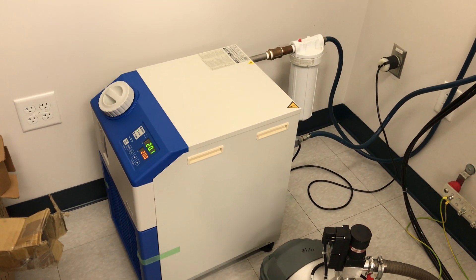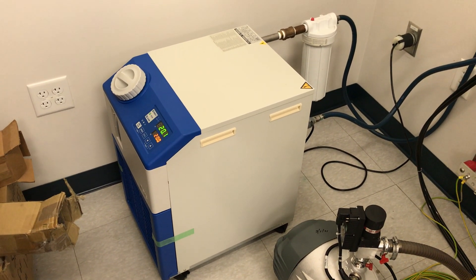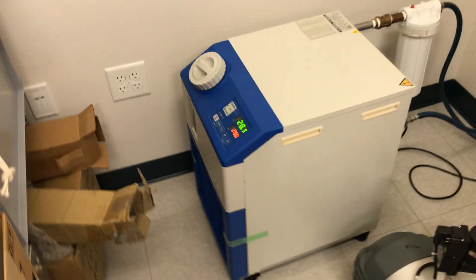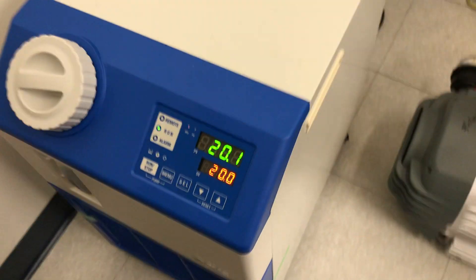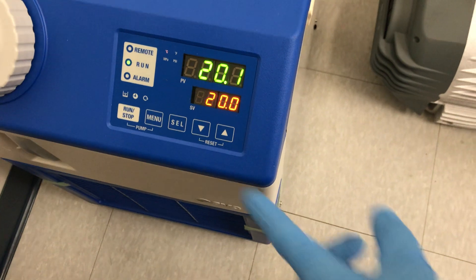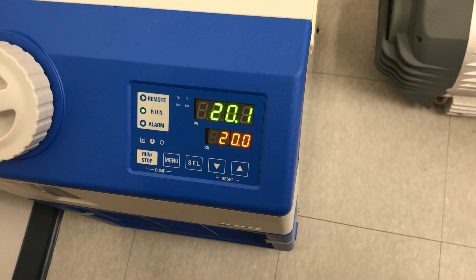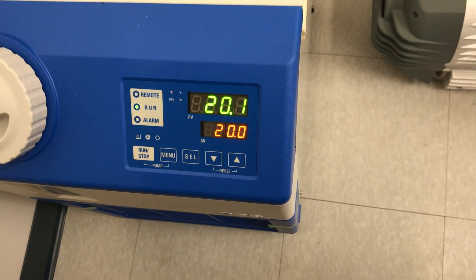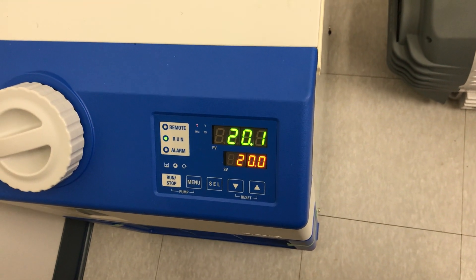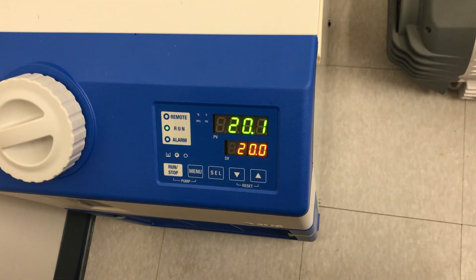The water chiller does two things: A, it chills the water, and B, it pumps that water through your microscope. You can see here on this particular chiller — the green number is the measured temperature in Celsius, and this is the set point. This is typically what most microscopes do as far as cooling temperature. It's usually set around 20 degrees Celsius, and you can see there's a small amount of fluctuation, but that's perfectly normal. With very little variation, this is about what you're going to set your chiller temperature to be.